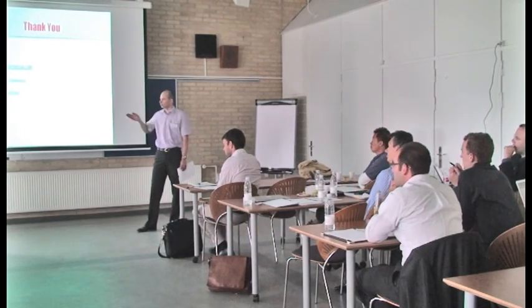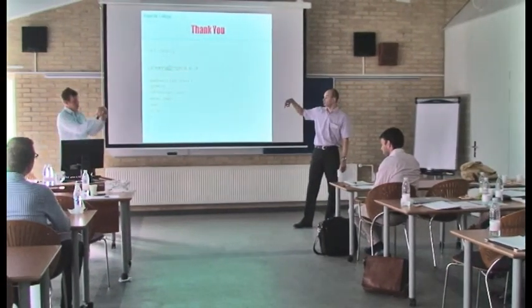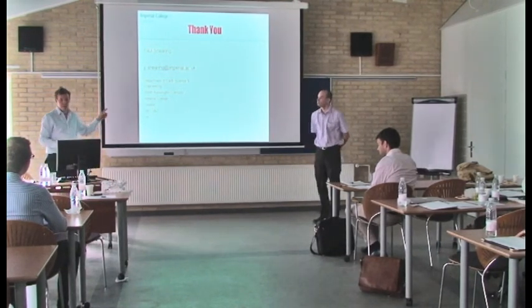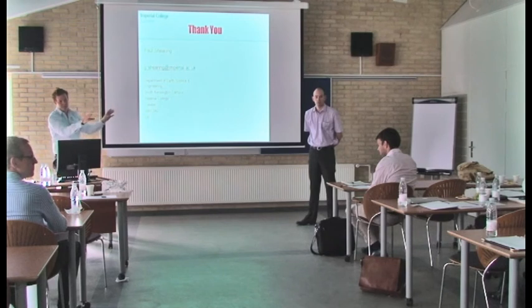Just to follow on that, it looks like when you extracted the chunk with the FIB, you used pretty high milling currents. So the microstructure near the surface, you definitely get some beam deposition on the edges of that, and you can see that in the video. So when we're doing a reconstruction, we also take a central chunk, so we're not getting all the gallium and all other kinds of rubbish on the outside.